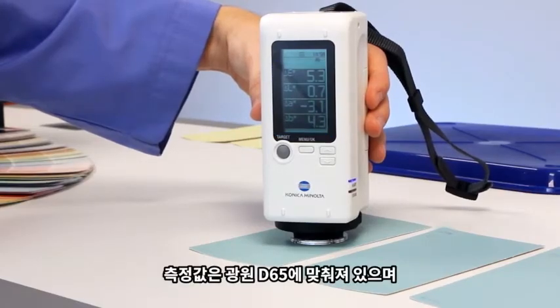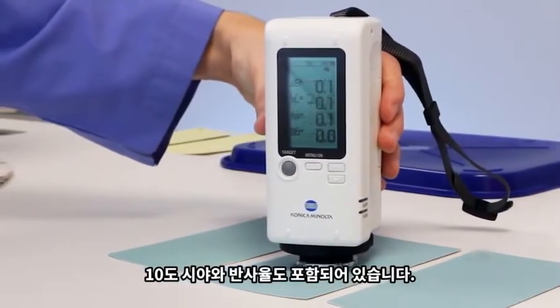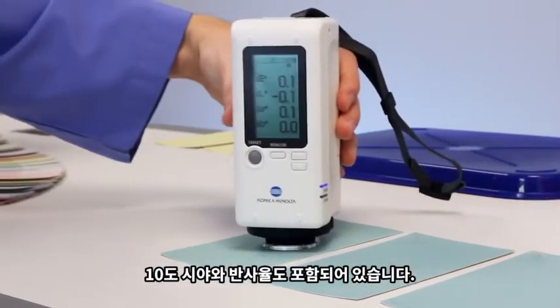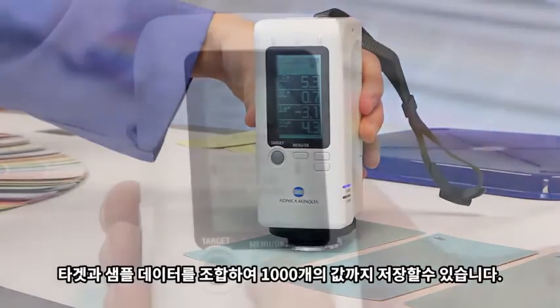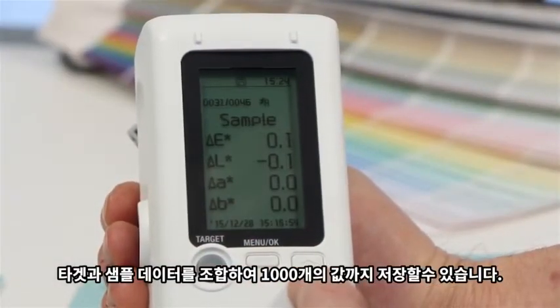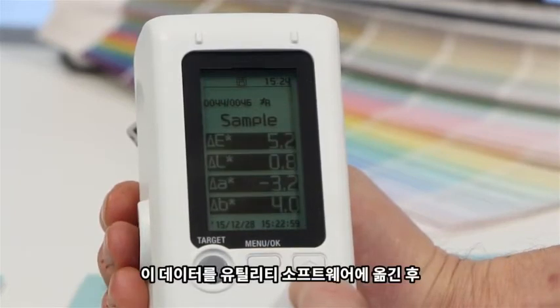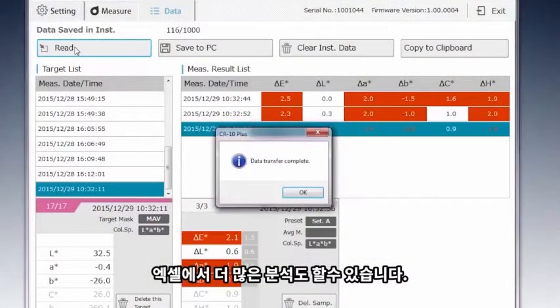Measurements are set in the standard Illuminant D65 with a 10-degree observer and specular component included. You can store 1000 readings, a combination of target and sample data, and upload this data into the utility software and paste into Excel for further analysis.